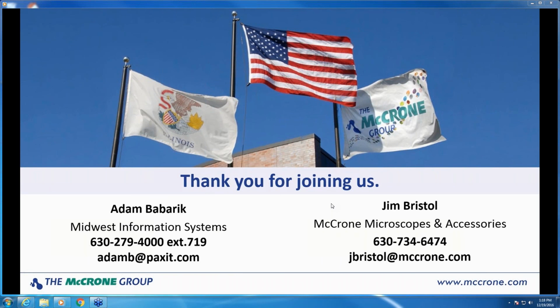McCrone also offers a full IQ service package for the microscopes that are used with the extended security installations. Services are performed on site, and all documentation is provided with all the test results. Users can also order system training time, either on site or remote, for introductions to the features and use of the software and hardware. Okay, great.